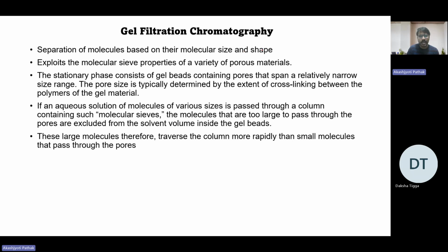Okay. So what is the principle of gel filtration chromatography? The principle is very simple. Basically, consider that, for example, you have prepared tea and you are straining the tea from the tea leaves. So what do you use? You use a sieve, isn't it?